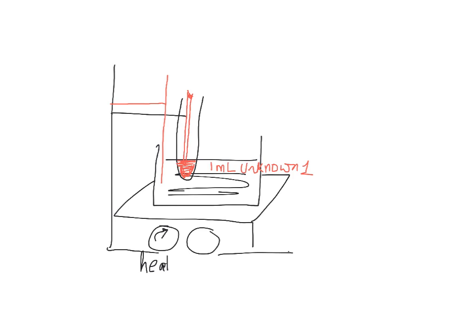that as you heat up the sample, the vapor pressure inside the capillary is going to start to build up, and you would see a bubble each time as the temperature rises. Each time you would see a gentle stream of bubbles generate. So bubble 1, bubble 2, bubble 3, you would see that. As you get closer to the boiling point, it is going to become rapid bubbling.